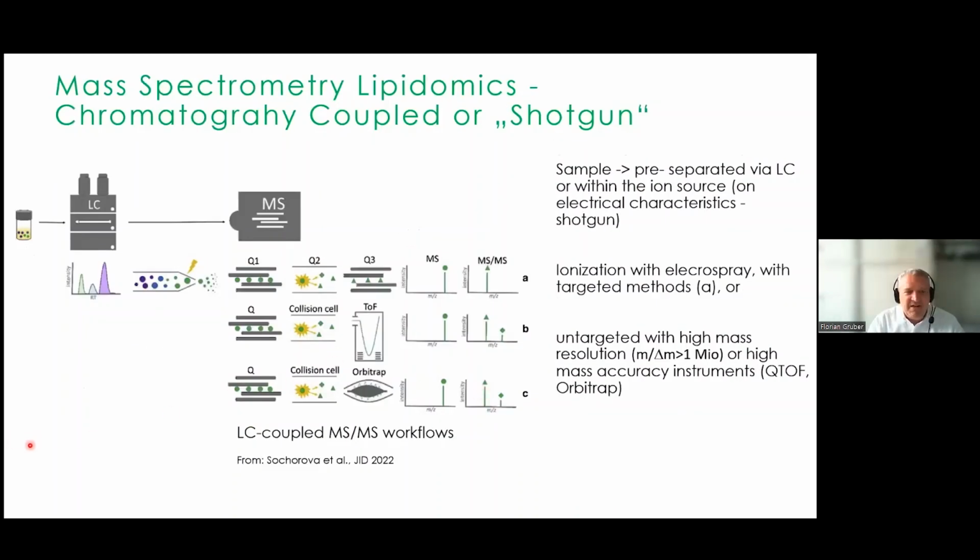In contrast in complexity is of course mass spectrometry, and mass spectrometry lipidomics allows for detection of the molecule mass to charge ratio for a very large number of lipids. The main prerequisite is that you can only measure molecules that can be ionized with the ion source.